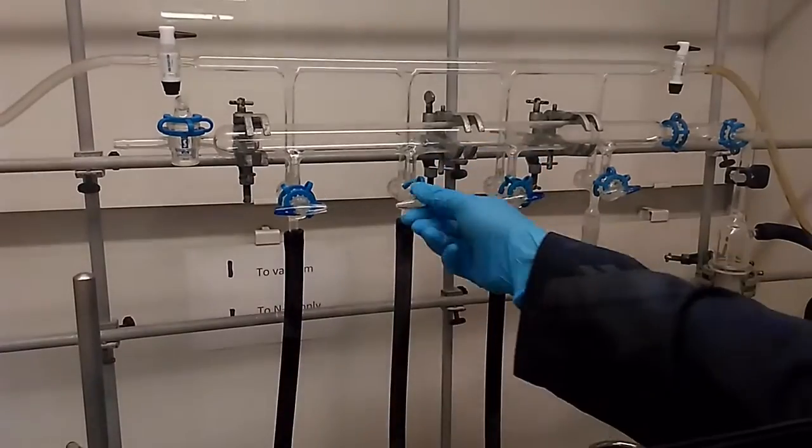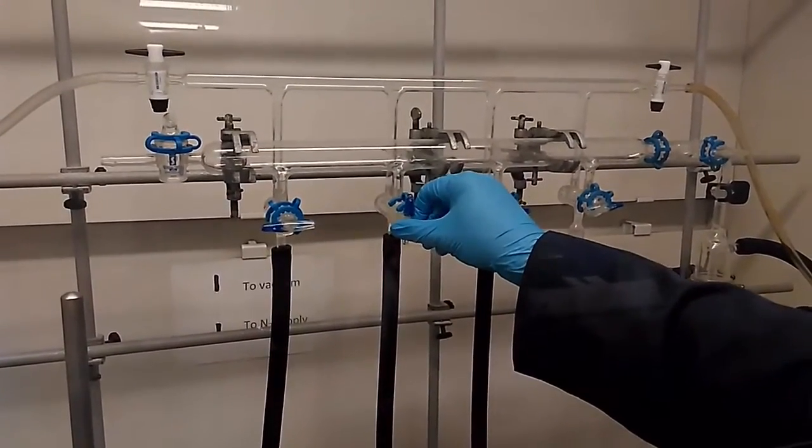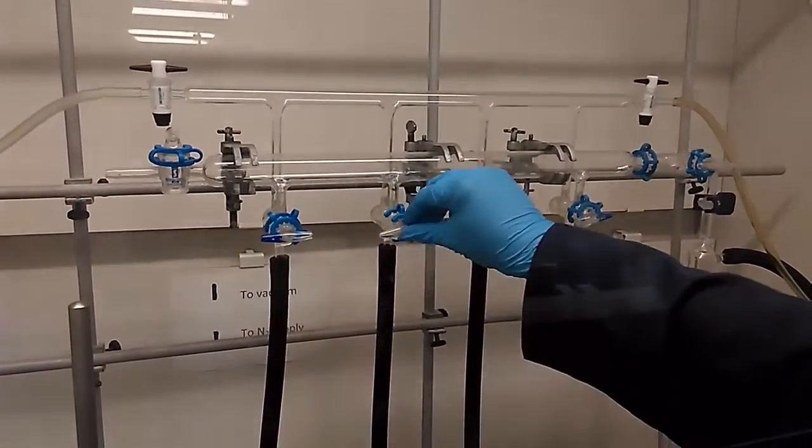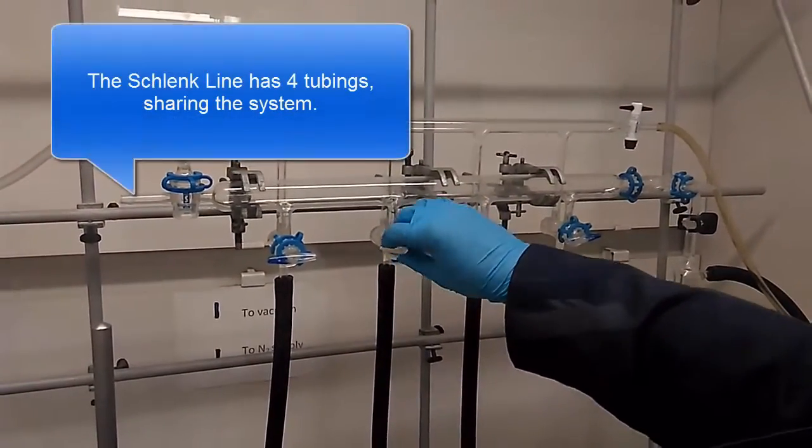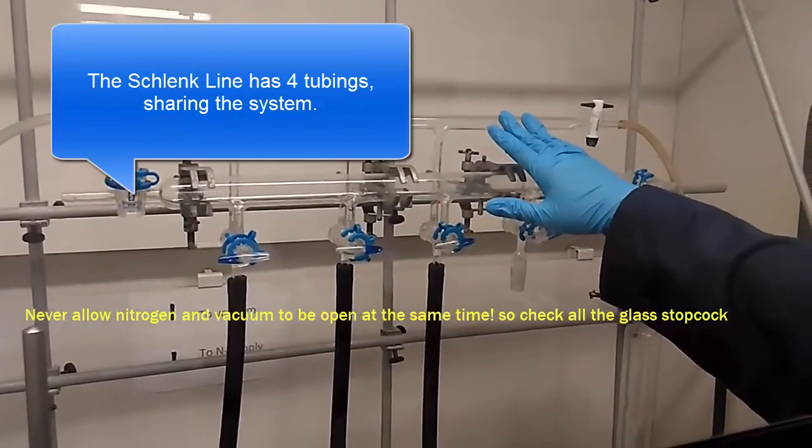If the stopcock goes up, we know that we are connecting it to the vacuum. And if the blue part goes down, we are having nitrogen going in. So here, we do not allow the vacuum or nitrogen to mix together.